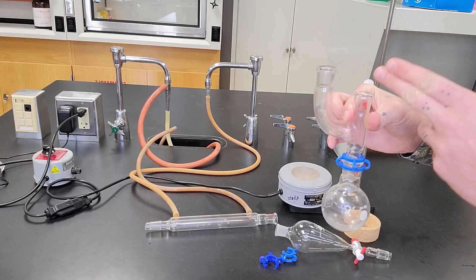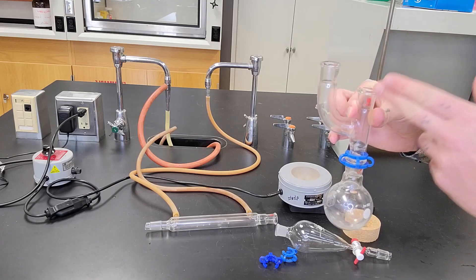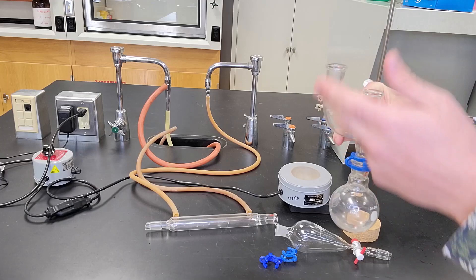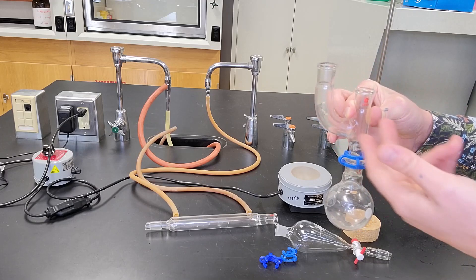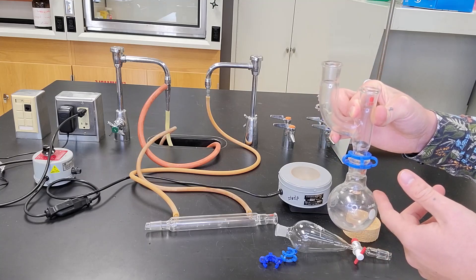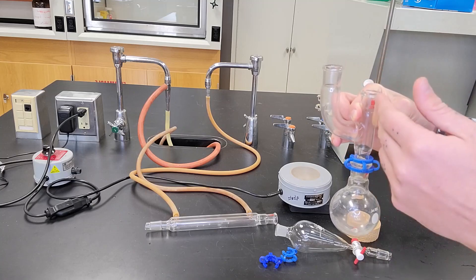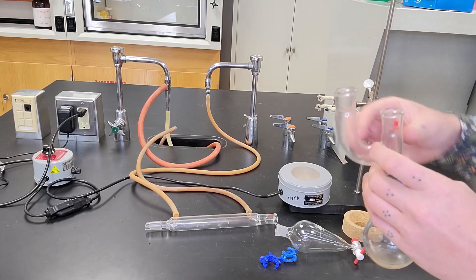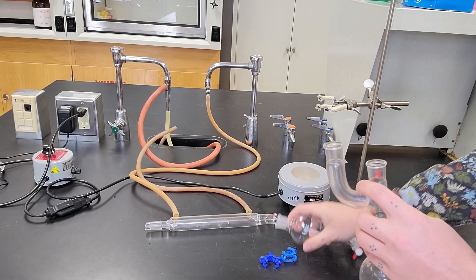Now the addition funnel generally goes in the port that's right above the reaction mixture. If we have it to the side, it may drip down and not actually get into the reaction flask. But if we have it directly above, we can guarantee that when it drops, it's going to go directly into the reaction flask.